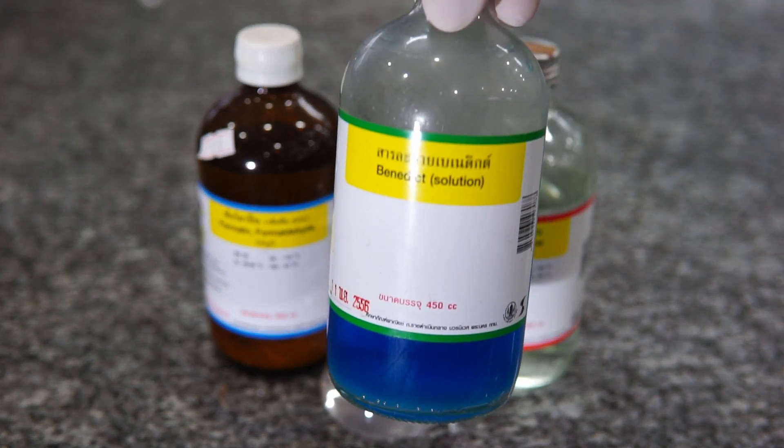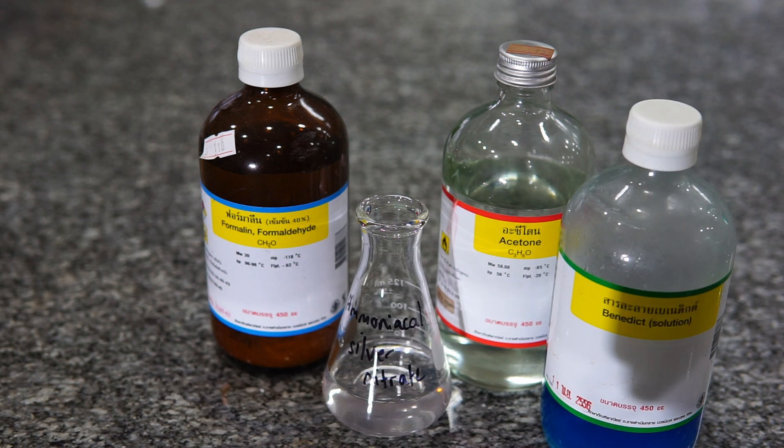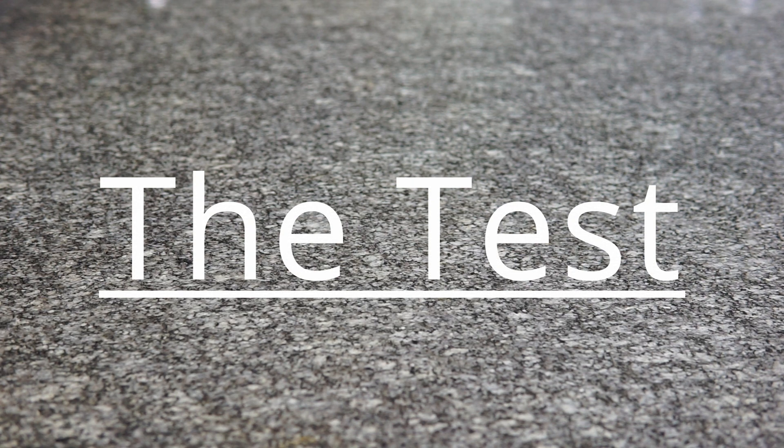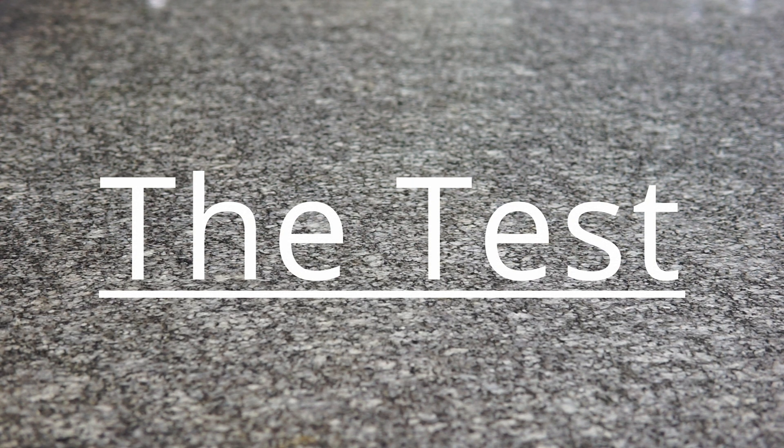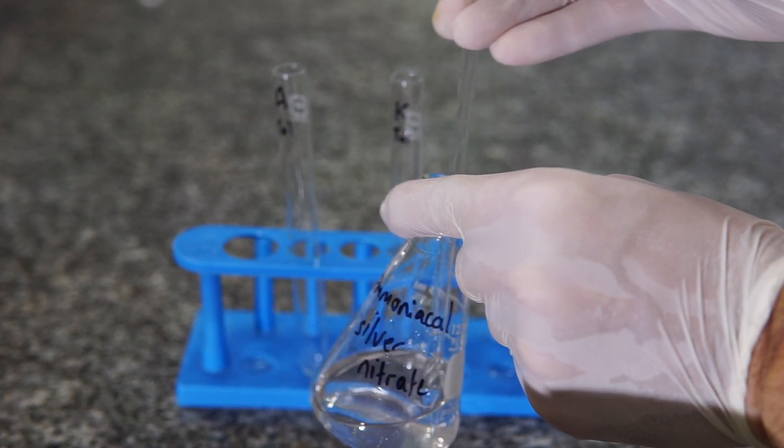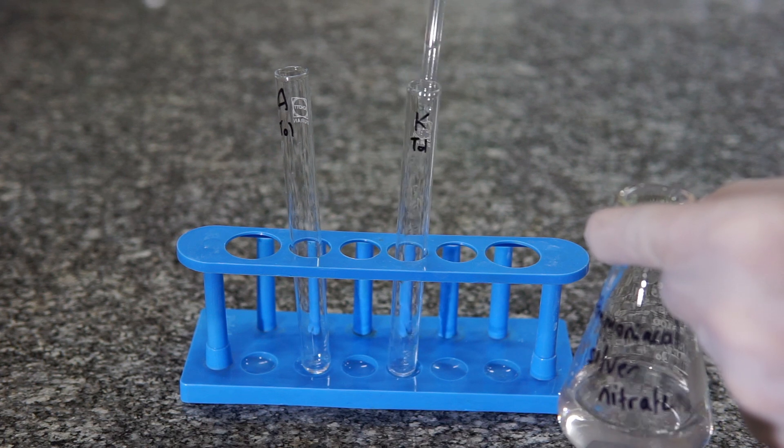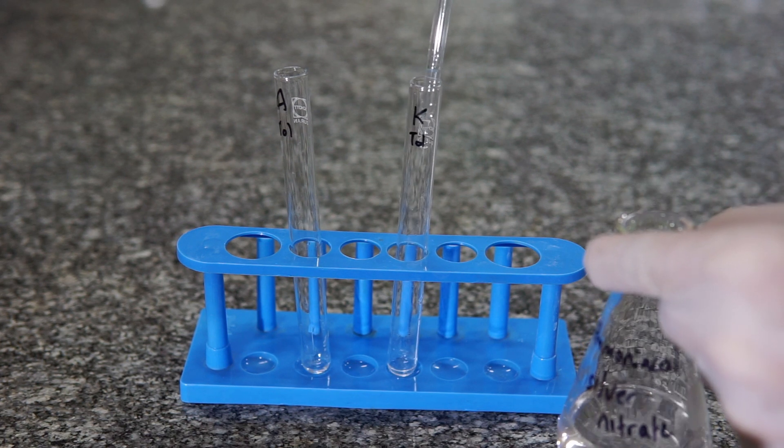As a comparison, we'll also do the Benedict's test as well. On to the test. I have two test tubes on the screen which I have labeled A for aldehyde and K for the ketone.